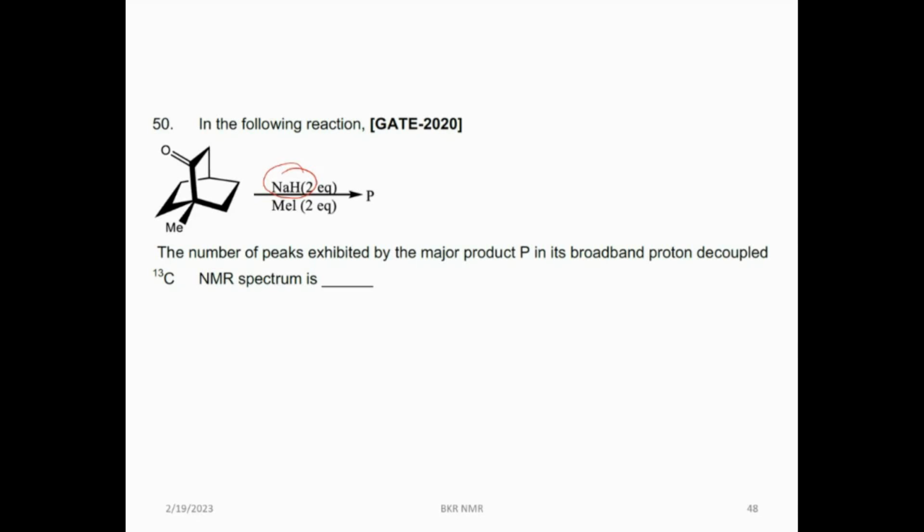Very good. Where? Carbonyl? Why here? Acidic nature. Activated hydrogens, like an active methylene. Why? When you remove a hydrogen, you'll have a negative charge, so it will be resonance stabilized. So you'll have removal here, the hydrogens going out, and the gem dimethyl coming out. Then you cut the molecule. Okay.